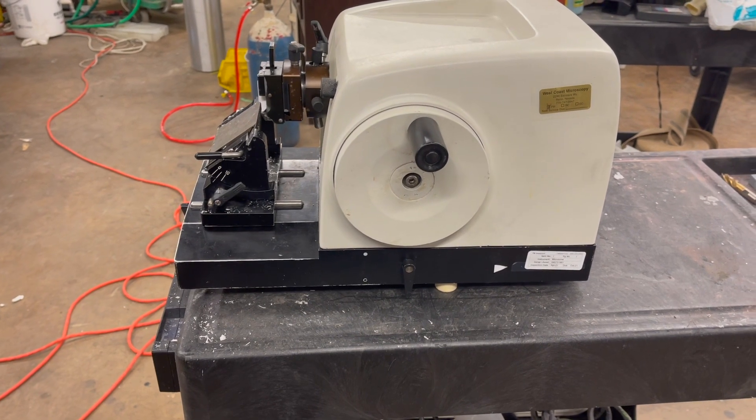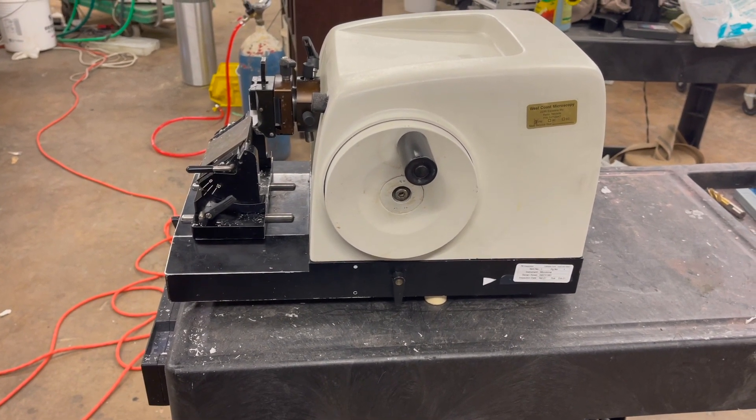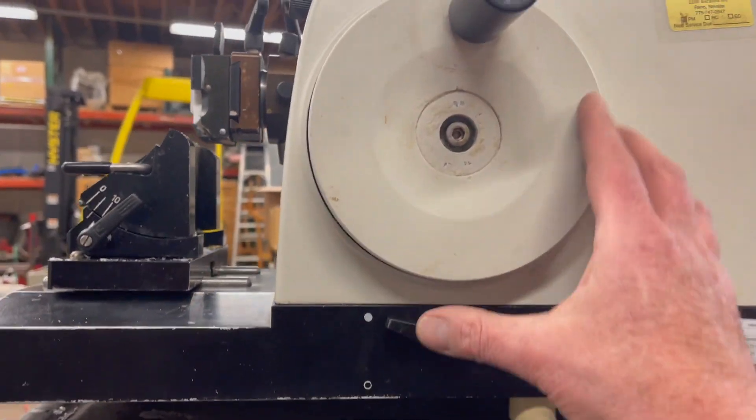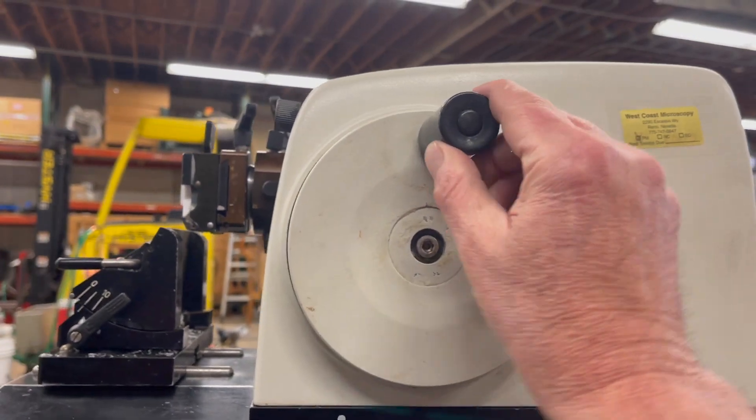Anyway, some older Leica Microtomes, and maybe some current ones, although I don't think so, have two hand wheel locks. So everyone knows about the lock down here, where if you lock this handle, you won't be able to turn the hand wheel.